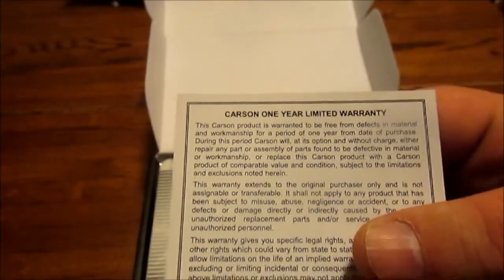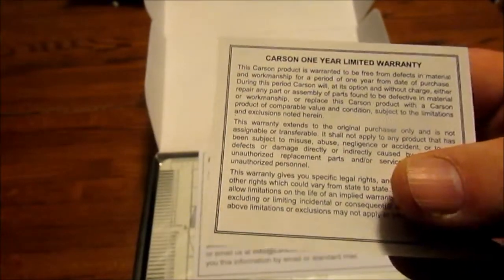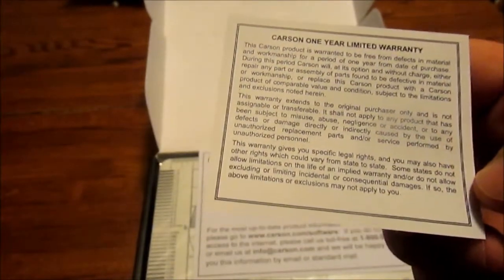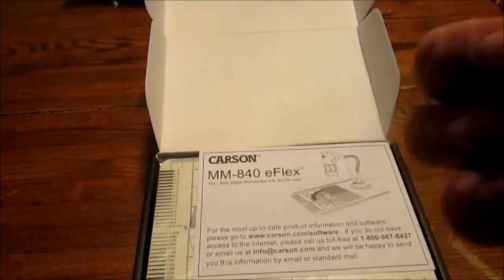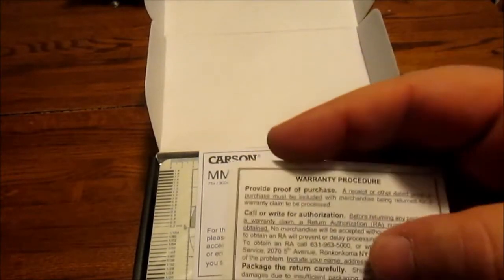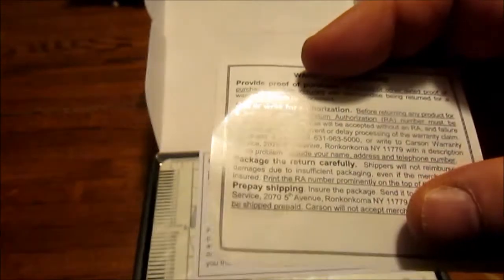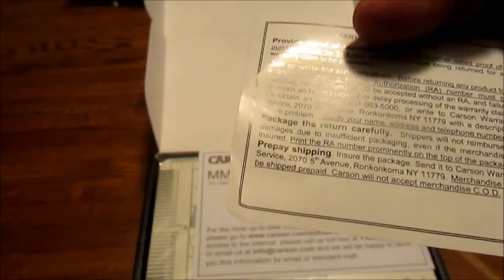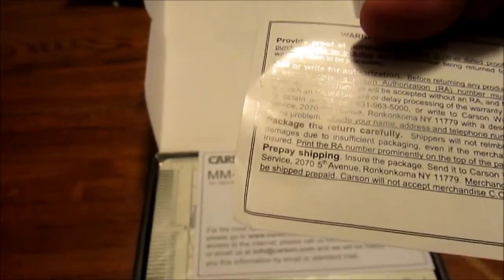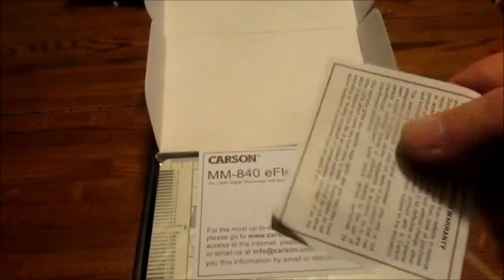All right, what do we got here — a one-year limited warranty, warranted to be free from defects in material and workmanship. Extends to the original purchaser only — yeah, that's pretty much it. Warranty procedure on the back requires a receipt or other dated proof of purchase, and you have to prepay shipping. They will not accept merchandise COD, so even if you have to send it back, you pay — go with Amazon.